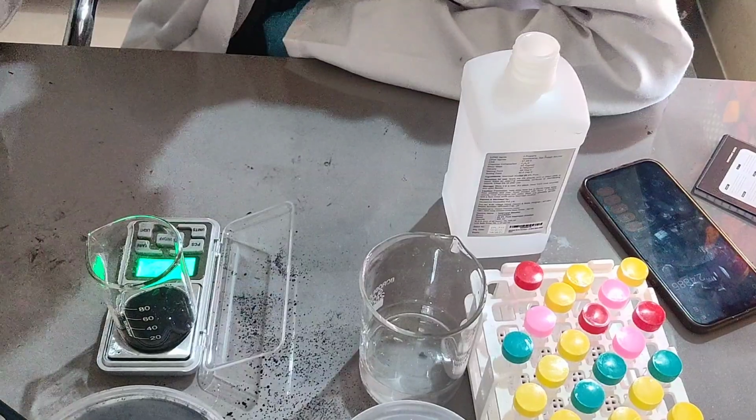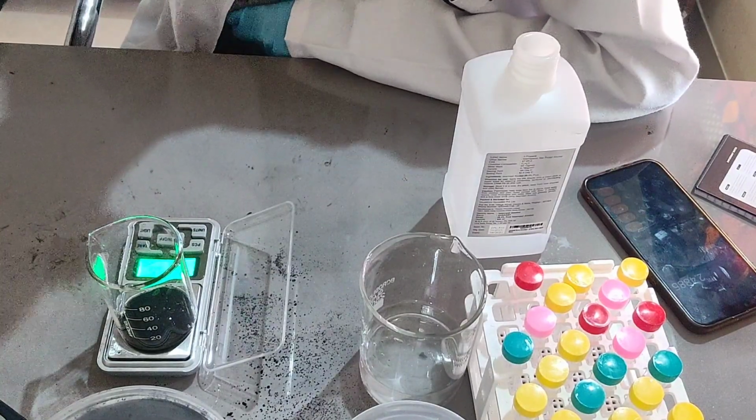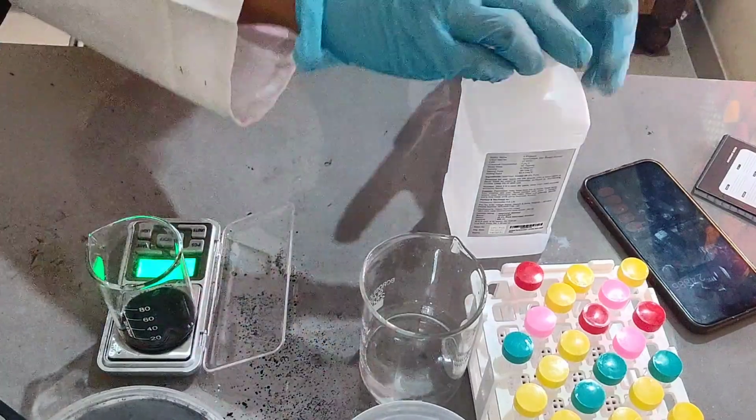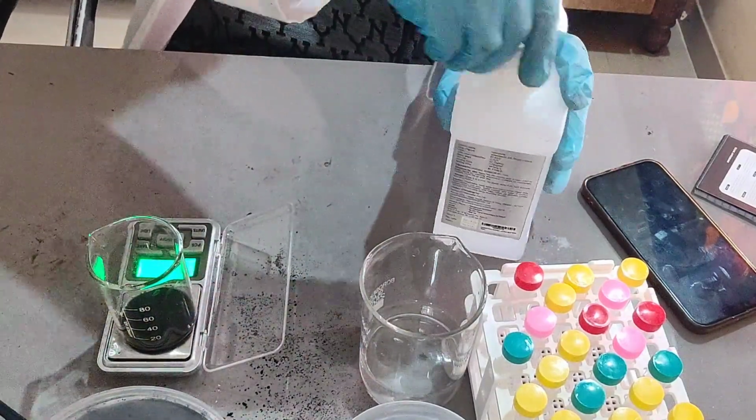And as always, 0.4 grams of water. Mix it all up.